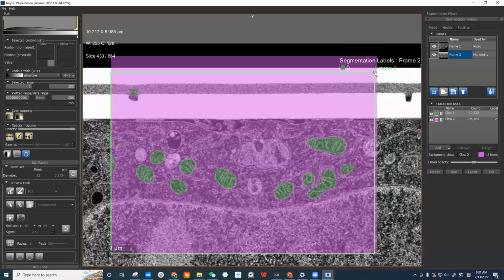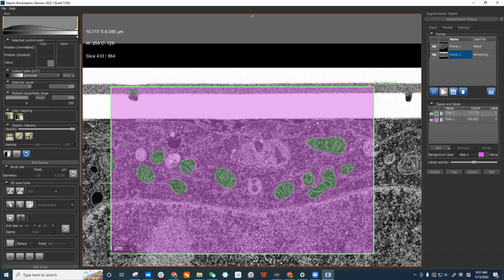So if I'm resizing my frame, I need to give it a little bit, so then it will learn from this, oh, this part is background. So it's very clear. The feature is very clear. So I don't need to have too big an area for that part. And also I can remove some if I don't even want to use the whole.